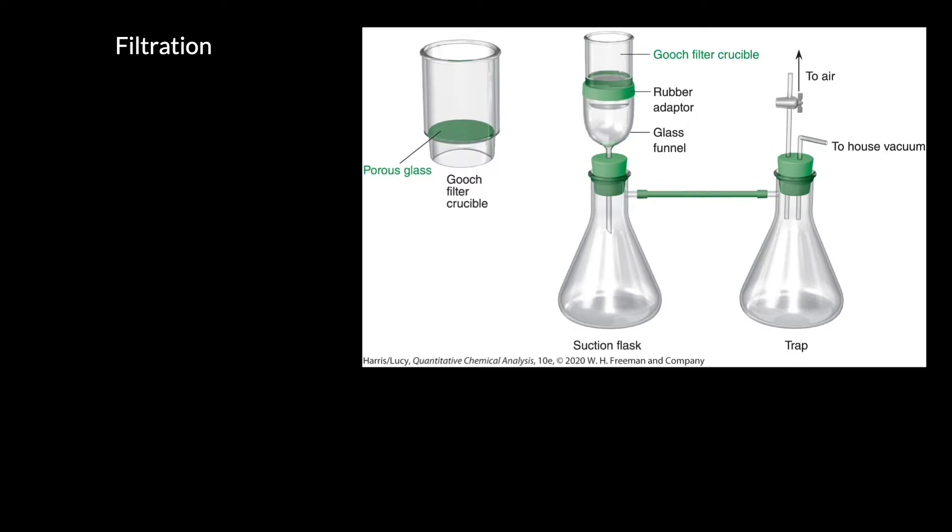Many times in the lab part of the course, we will filter our precipitate and weigh it. We will use not filter paper in a funnel, but what's called a fritted glass funnel or a gooch filter crucible.